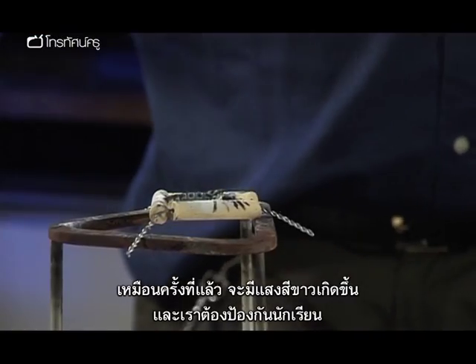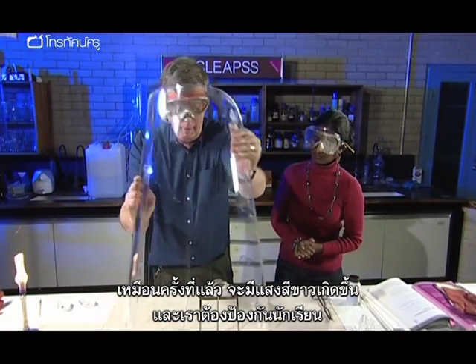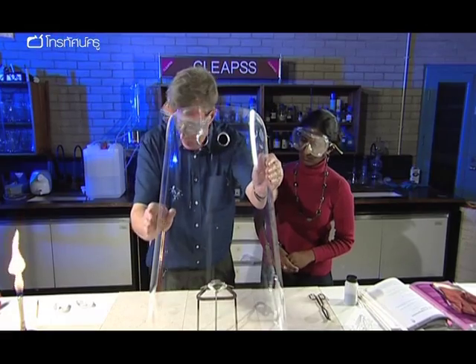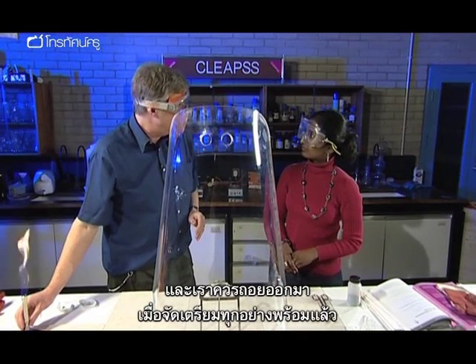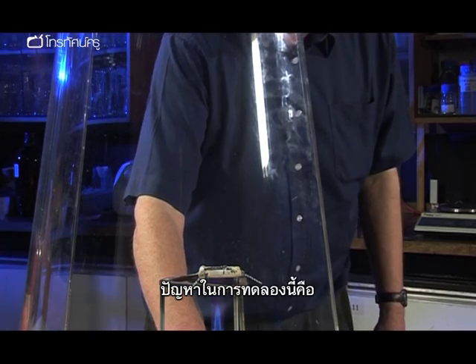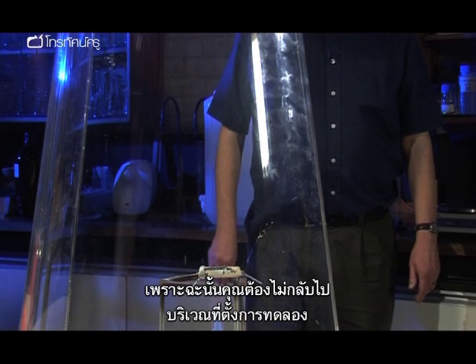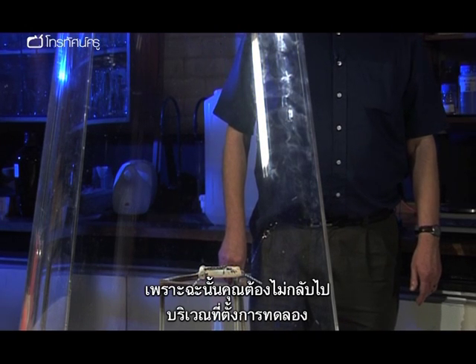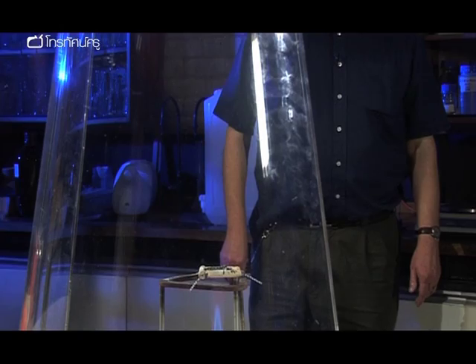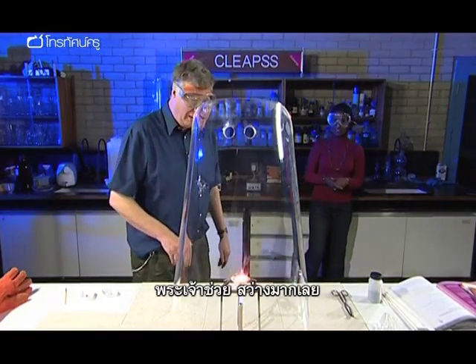Again, we're going to have an intense white flash, and we do need to protect the pupils again, and we shall need to step back once to set it going. Right. The problem with this experiment is that you never quite know when the flash is going to occur, so you must never return to the actual experiment. Ooh. There we are. My gosh, that was bright.